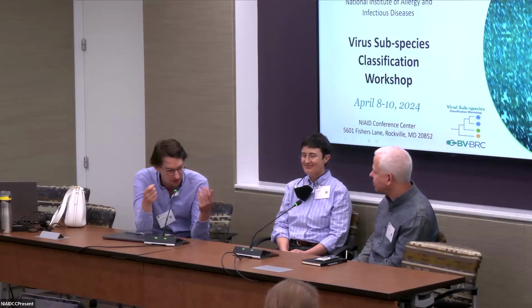Nextclade calls that belonging to the lineage, even though UShER, being totally correct, says it shouldn't be part of the lineage because it lacks one thing. But because Nextclade approximates, it will call that to be part of it. That's an imperfection we have that UShER doesn't have, because it has a better resolution.